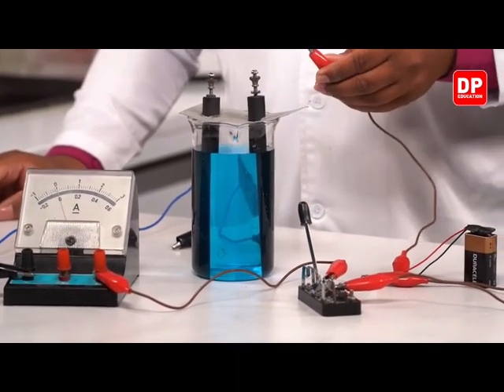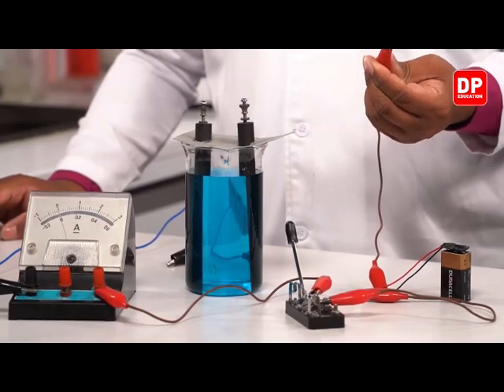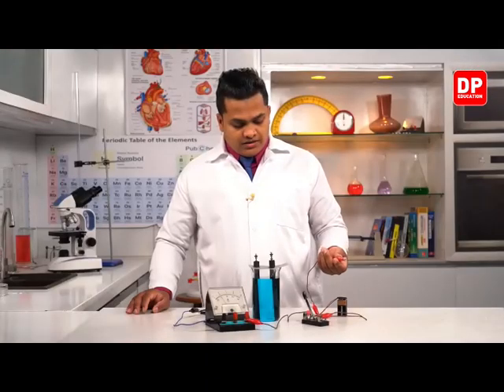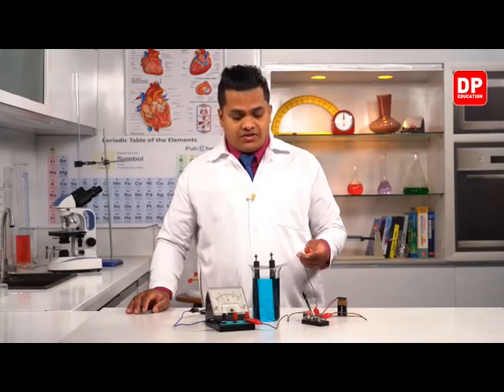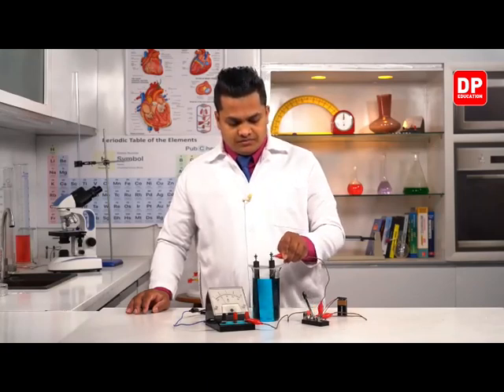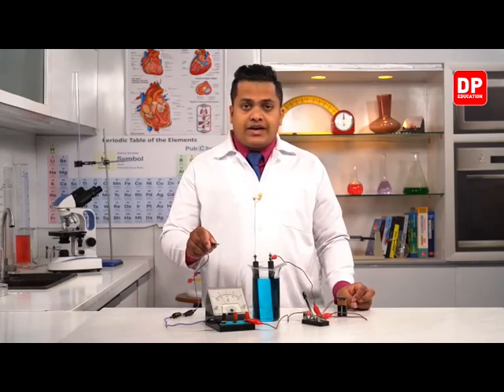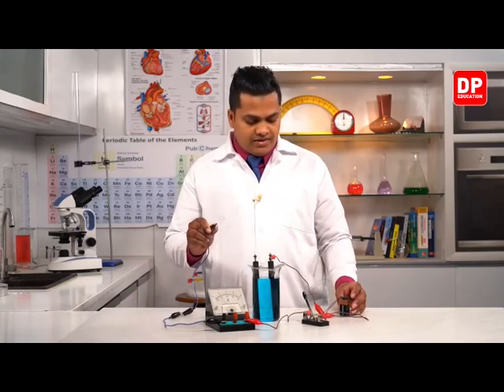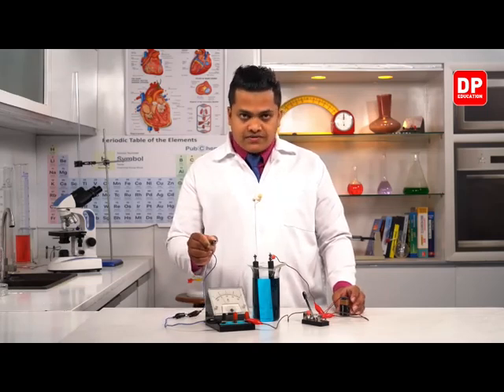Now let's connect these two. The red color terminal indicates the positive terminal. So this is the positive terminal. And the black color terminal indicates the negative terminal.